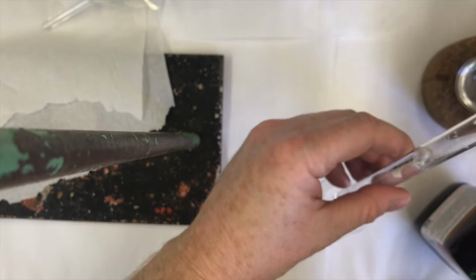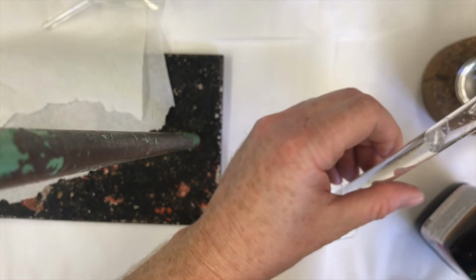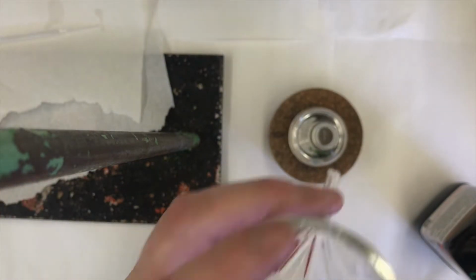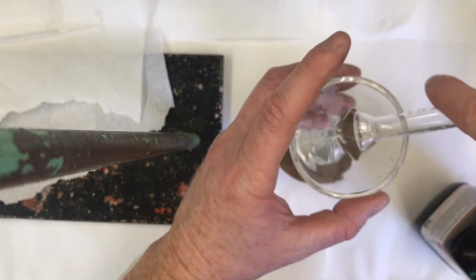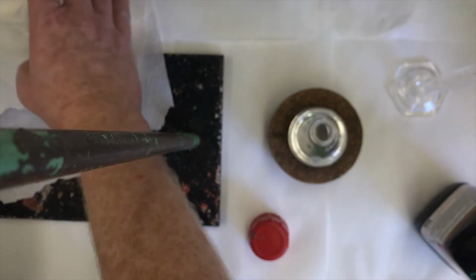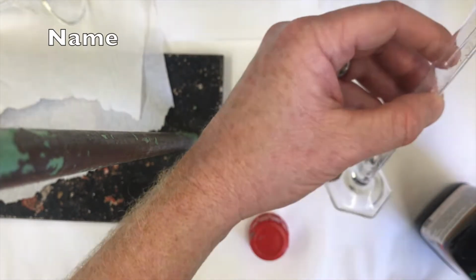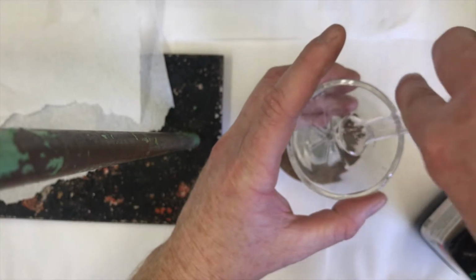Now I'll pipette to about 10 milliliters. Okay, and then pour that into the round bottom that already has the ethyl acetate. And another 3 milliliters of bromobenzene. Okay.